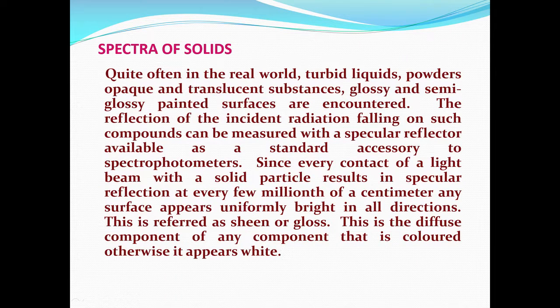So, coming back to the spectra of solids, quite often we come across situations like this, and then the sample compartment needs to be modified with respect to solids, because we have to make color measurements. Since every contact of the light beam with a solid particle results in specular reflection at every few millionth of a centimeter, any surface appears uniformly bright in all directions.